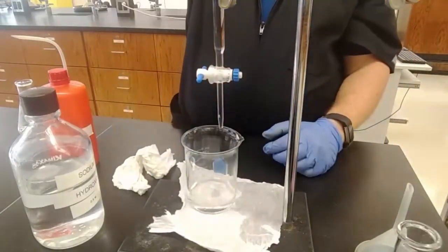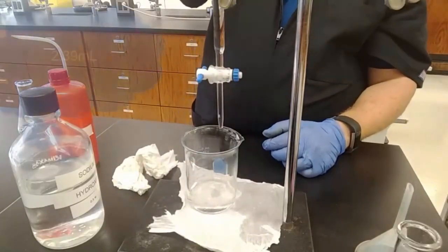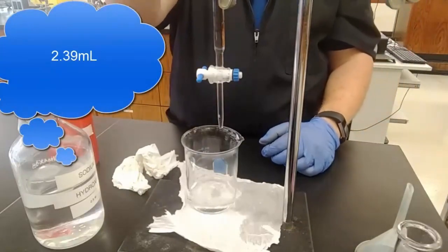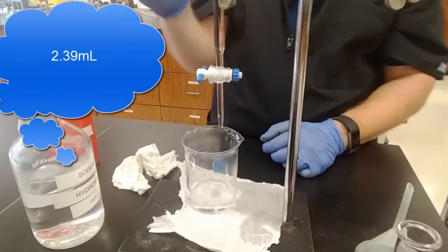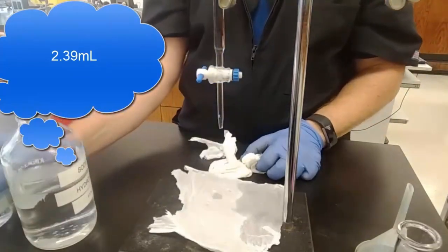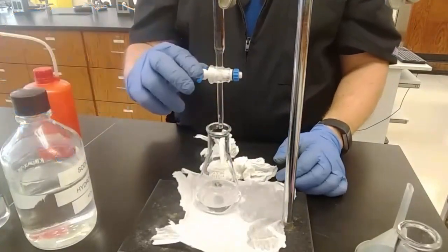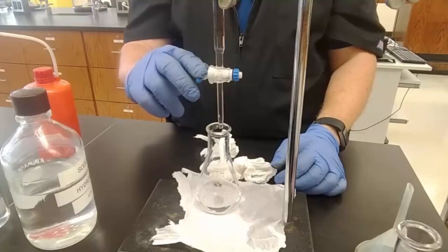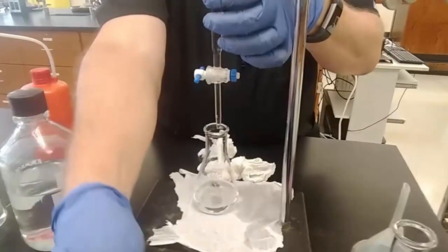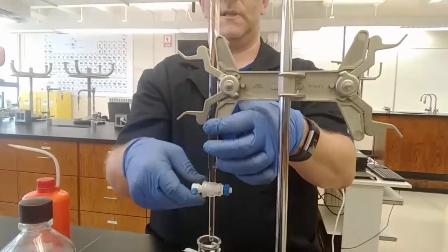We're starting this time at 2.39. It's really, really close to the 2.4. 2.39. Yep, 2.39. All right, away with the waste bottle, in with experiment number 3. I know that it's going to take about 17 milliliters, so I'm going to go rapidly up to 18 again. Just putting my finger on it so that I know where to stop, and I'll just let her rip.